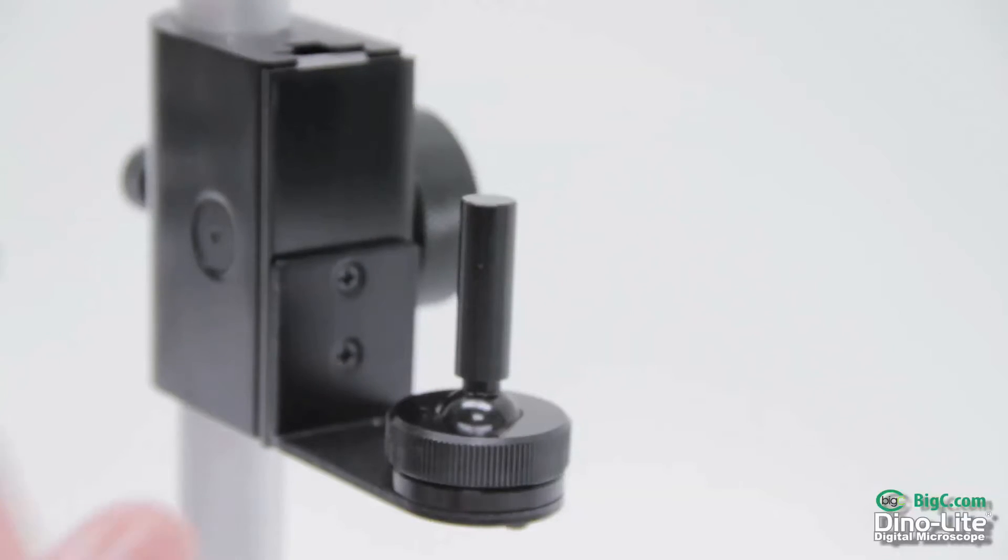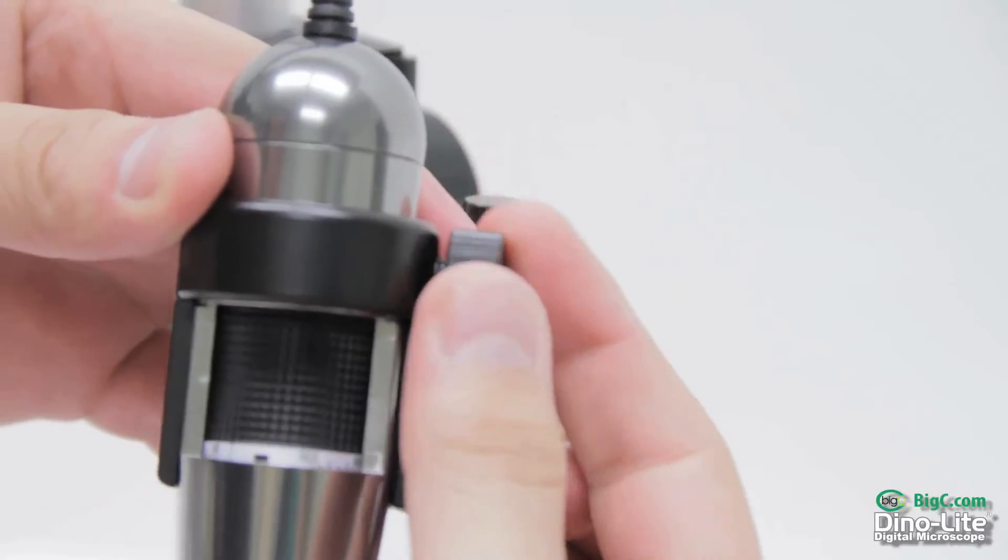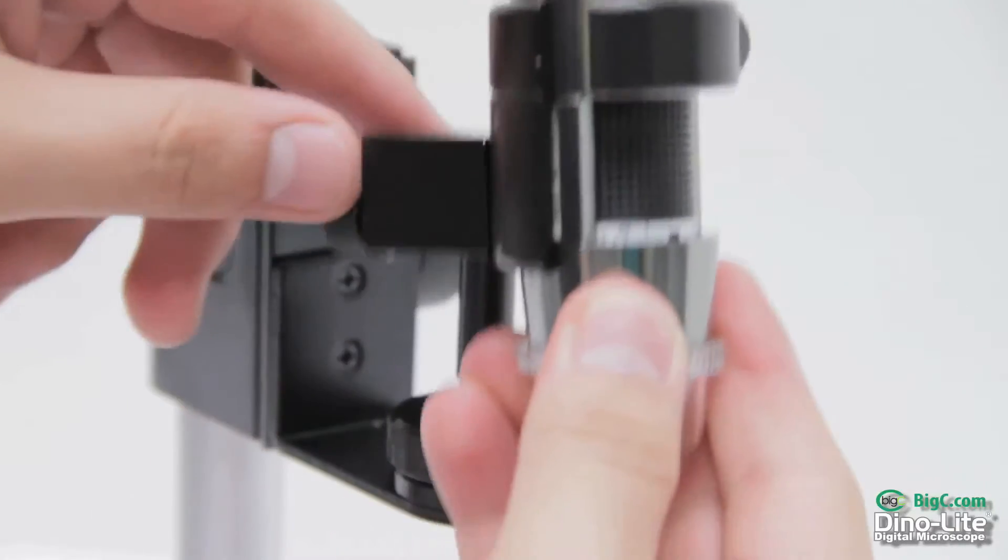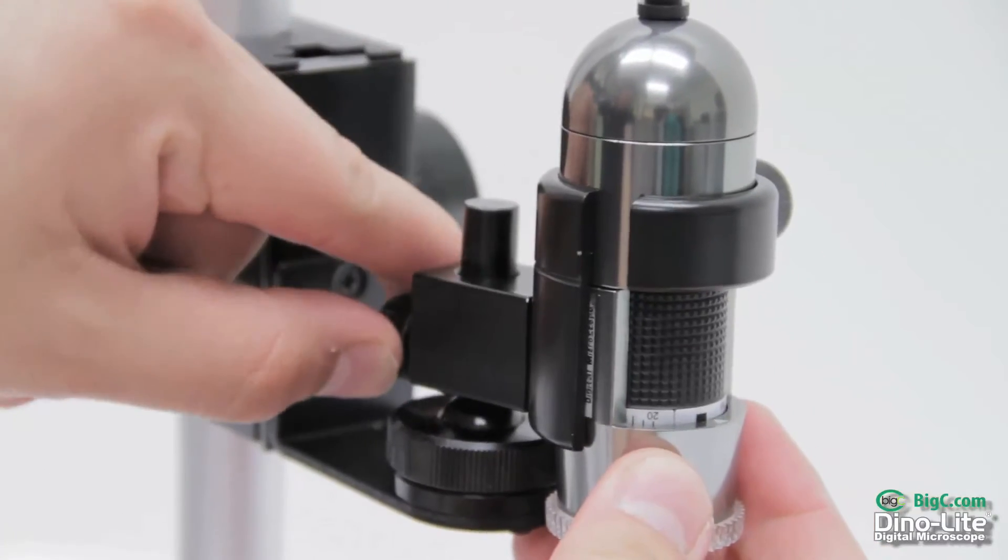Fourth on our list is the MSA2M. This model is the MSA2Z's big brother. It consists of all metal and has a fastening set screw to hold the scope in place.